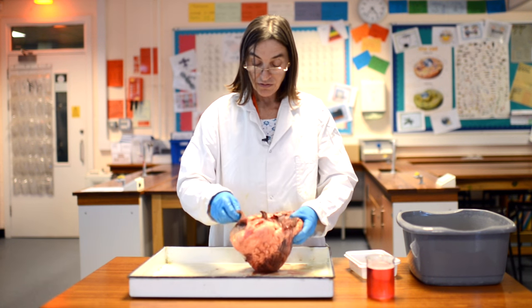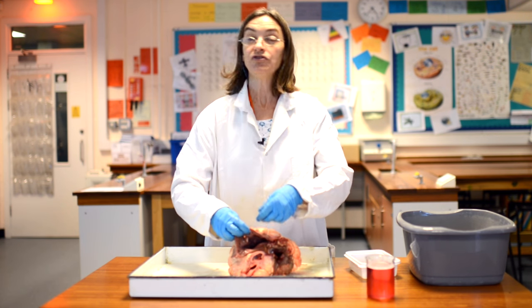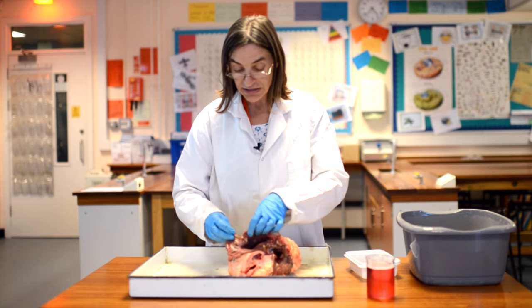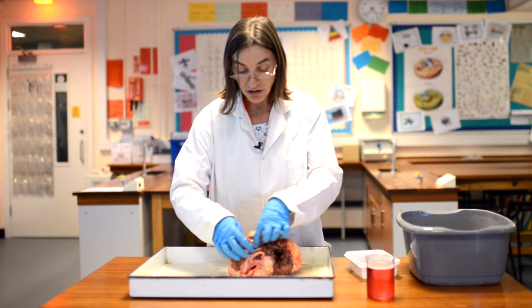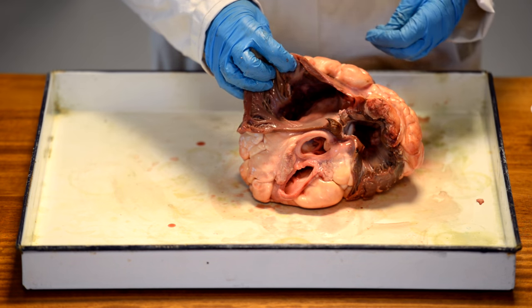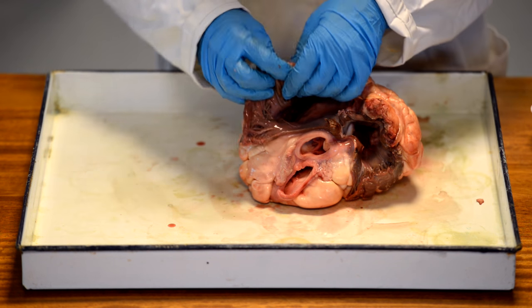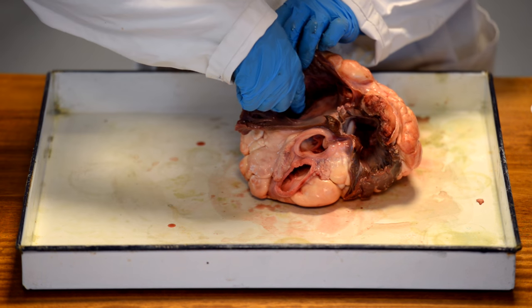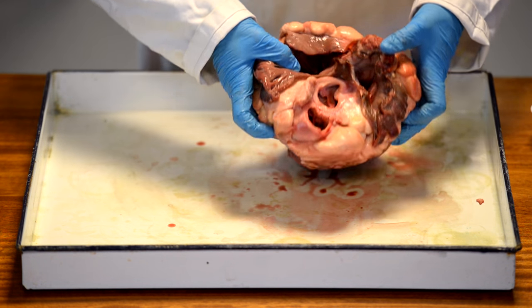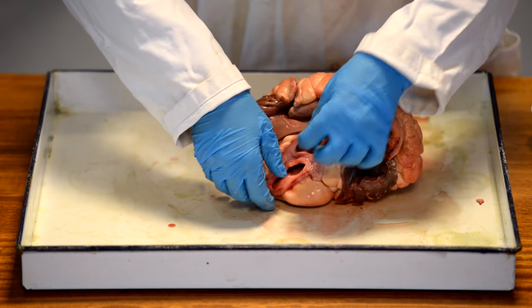And it goes into this area, which is all tatty on this heart, but it goes into this area here, which is the right atria. Now, it comes into the right atria through the major veins, and we haven't got any veins on this heart, but the major one, nice name to remember, is the vena cava, the cavernous vein. A massive great vein that brings the blood back from the body into the right atrium, then through the right atrium into the right ventricle, and then the blood leaves via the pulmonary artery.